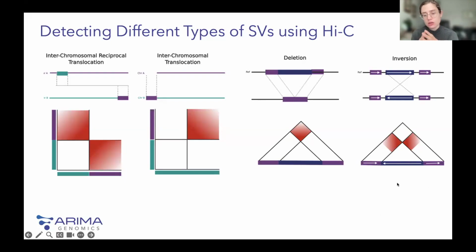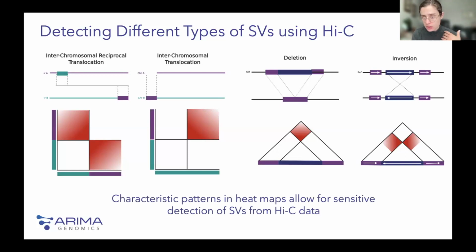Generally, all the algorithms that use Hi-C data to identify SVs are, one way or the other, looking for these motifs. Hi-C Breakfinder, which is the algorithm that we're using, is in its own way trying to identify these motifs. There are some other methods that have been published recently. A very interesting paper that came out was EagleC. They use deep learning, but we've decided to use Hi-C Breakfinder because it's more widely supported for folks that come from either industry or academia, right?